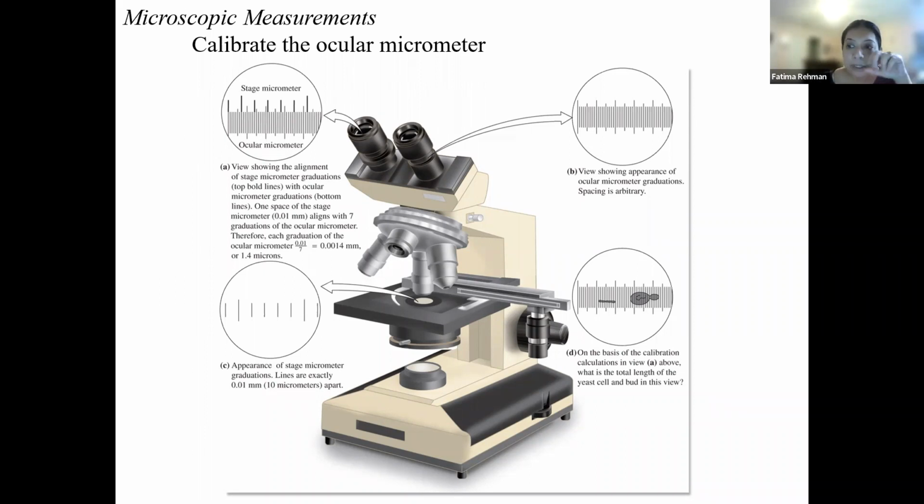So if we are going to compare these tick marks so that we can know what physical size they are, what do I need to put underneath it to get a physical length of each tick mark? What do I need underneath on the stage? It can't be my cell because I don't know how big it is. What do I need to use instead?